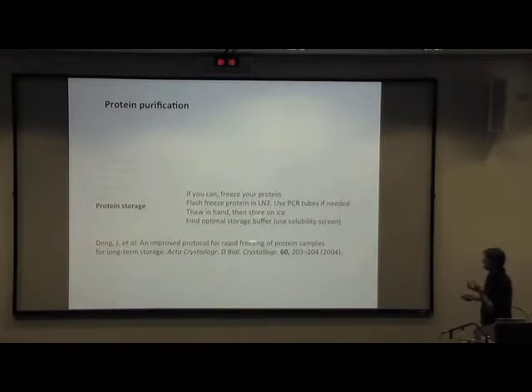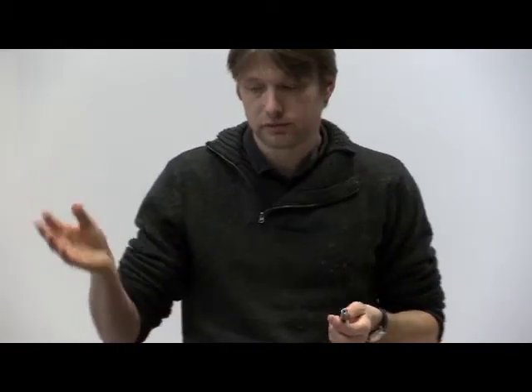And then, once you've got your protein, it's worthwhile examining what the buffer is actually doing to your protein. I will get back to that later, because you've chosen a buffer, probably Tris because it's cheap and everybody's using it, but maybe Tris is not good for your protein. You might want to use something else. You probably add some glycerol to it, but in most cases glycerol doesn't do a lot.